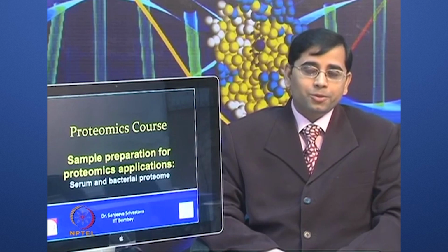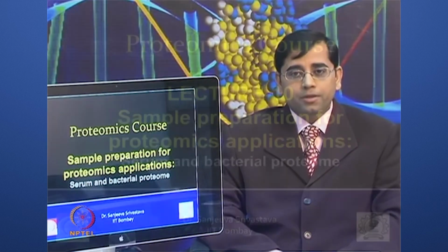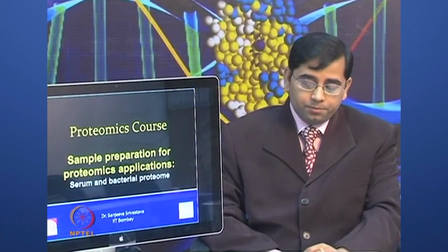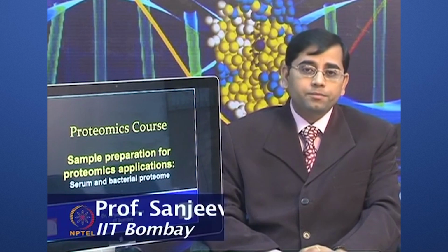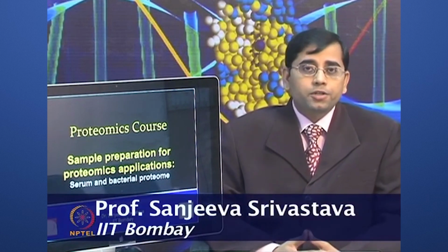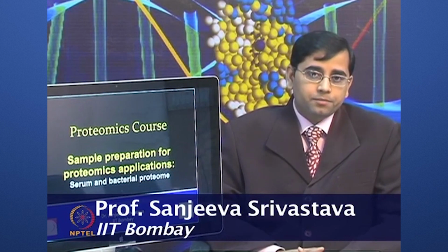Welcome to the Proteomics course. In today's lecture, we will talk about sample preparation for various proteomic applications. I will give you some specific examples for serum and bacterial proteome analysis. In the previous lectures, we were discussing the workflow, how to make a good protein sample preparation.